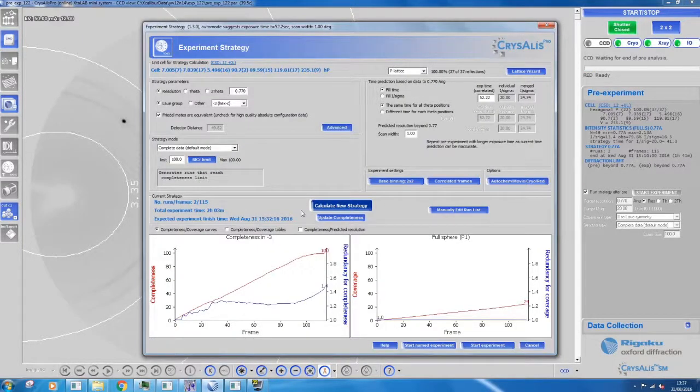After the pre-experiment, a data collection strategy box will appear. Before clicking the start experiment button, there are a few things to check beforehand. If you know what unit cell you're looking for, check to see if it's correct. Check that the orders of magnitude of the unit cell is sensible for the molecules involved. Check the percentage of reflections that match the given unit cell.